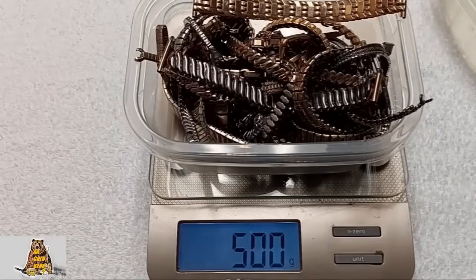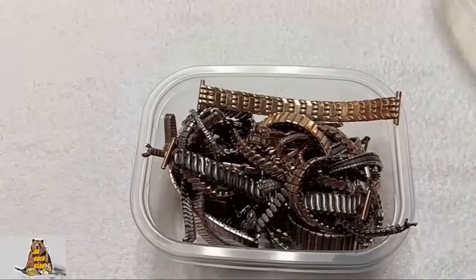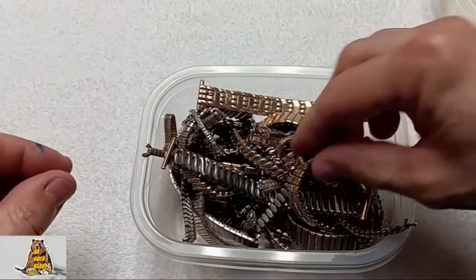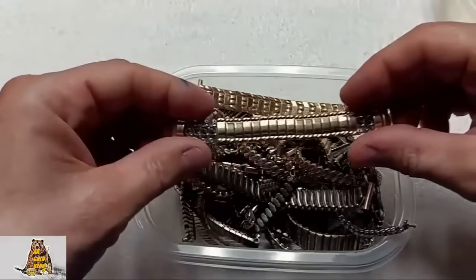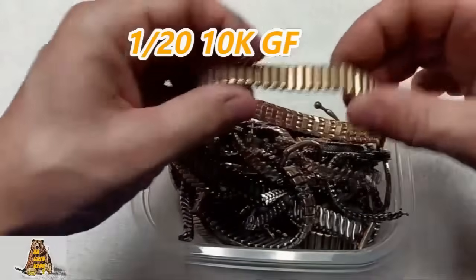Exactly 500 grams of watch bands with gold filled top and stainless steel bottom. All watch bands have the same marking: 1/20 10 carats gold filled.